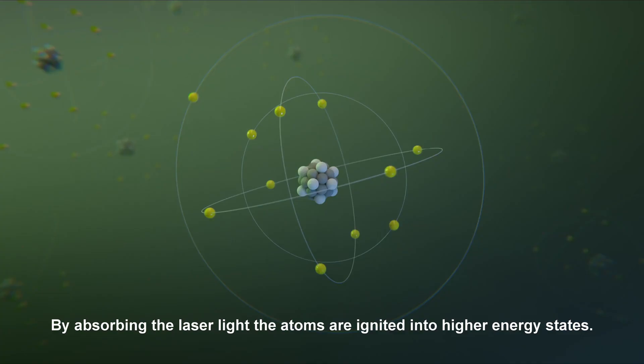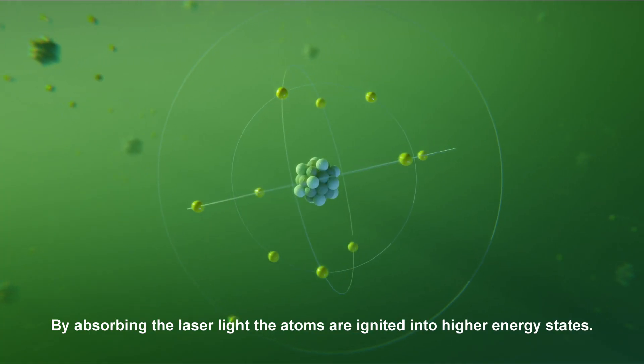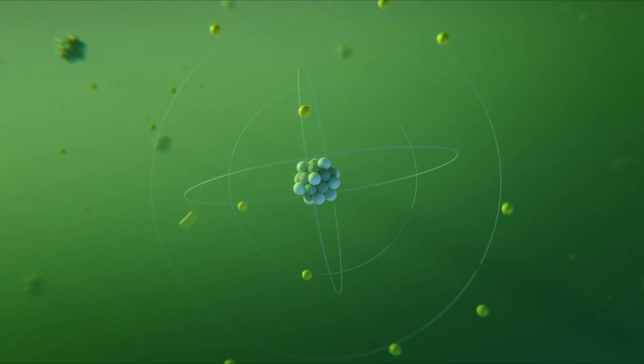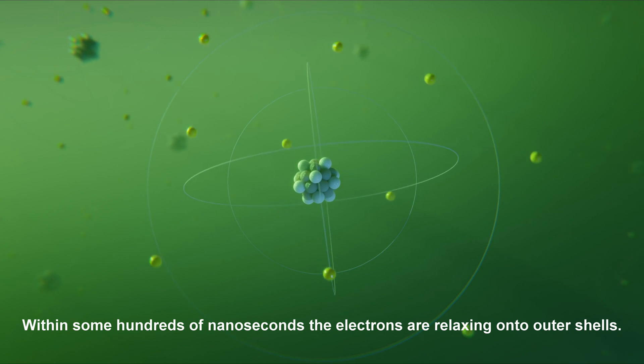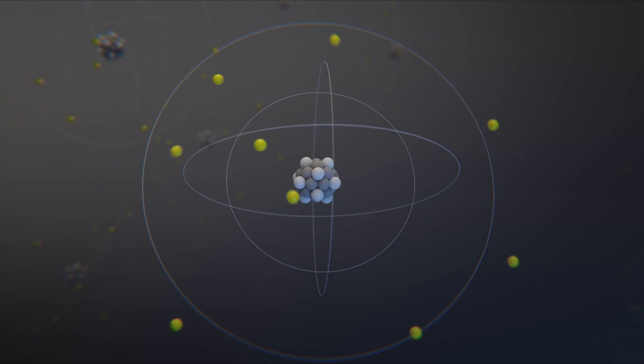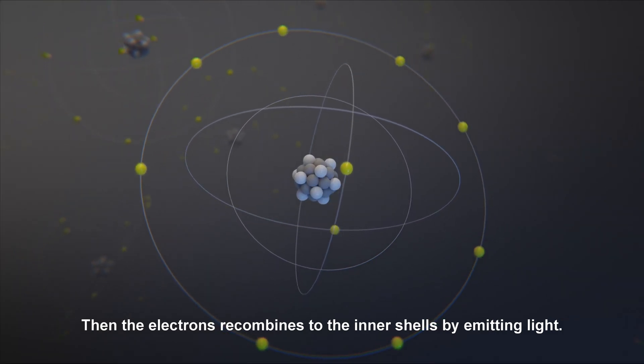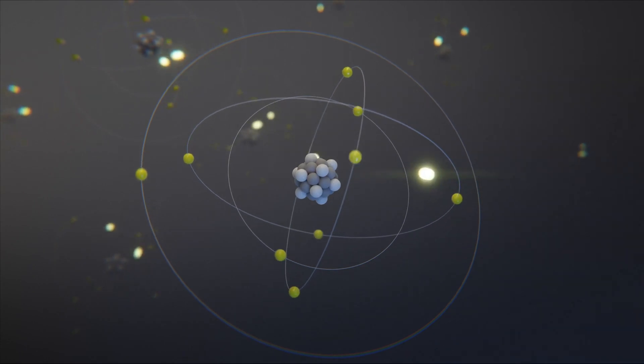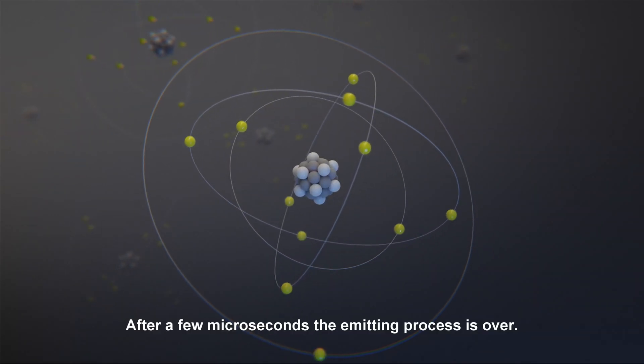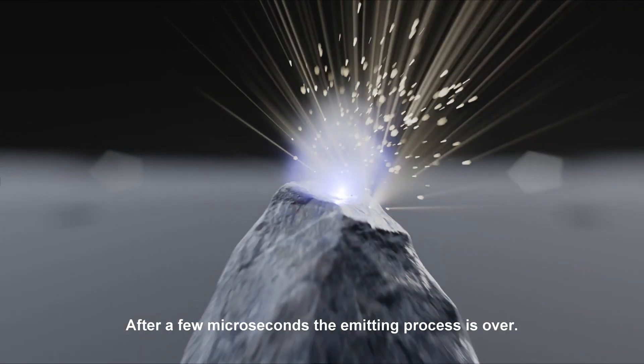By absorbing the laser light, the atoms are ignited into higher energy states. Within some hundreds of nanoseconds, the electrons relax onto outer shells. Then the electrons recombine to the inner shells by emitting light. After a few microseconds, the emitting process is over.